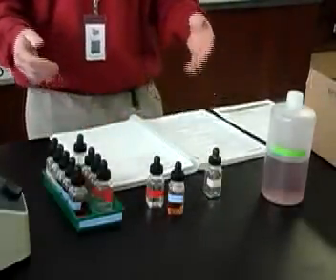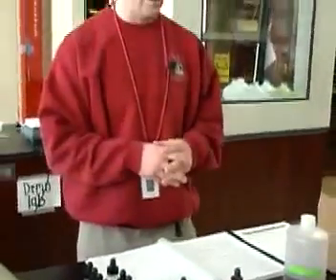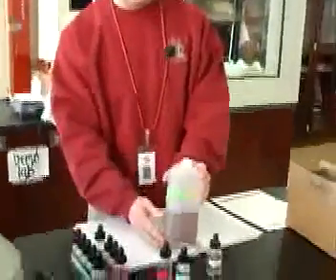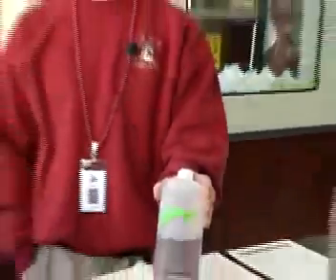So then when you walk in on Tuesday or when you walk in next week to start the lab, you're prepared to start with the 10-ion solution, the solution that has all the qualitative analysis ions in it. And you can start from step 1, take good notes as you go along, and separate the ions. So then later in the week when it's time to start with your unknown solution, you've got a good reference to look back on.